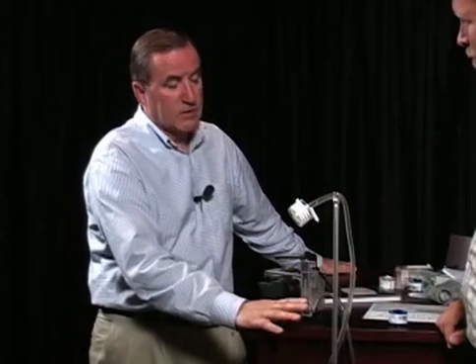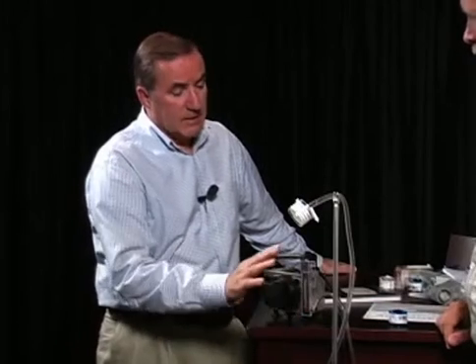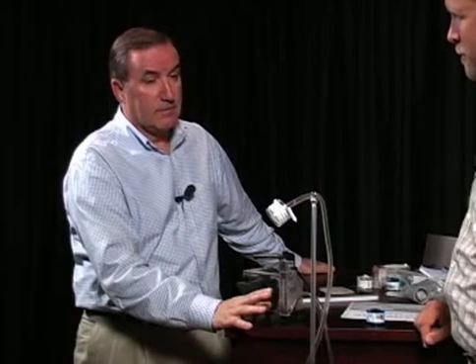So you should stay in the same room, maybe looking at the rotometer as it's going. Walking around and doing other things and coming back in about 9.5 minutes wouldn't be a good idea. Well, if you're sure that it's going to work properly, but it's better to just watch it. It's better because then you don't have a question about it. So 10 minutes can seem like a long time watching a pump draw air, but it's probably worth it.